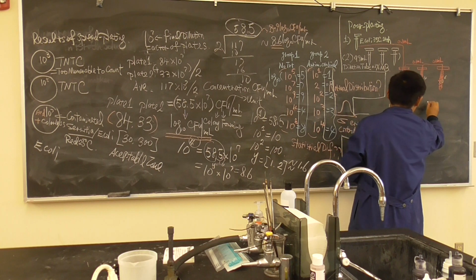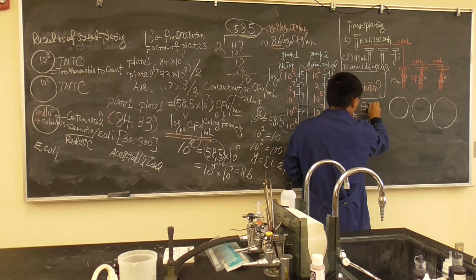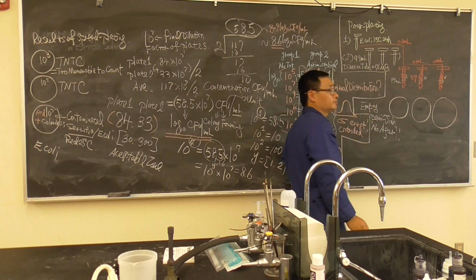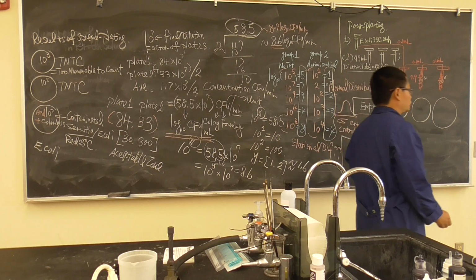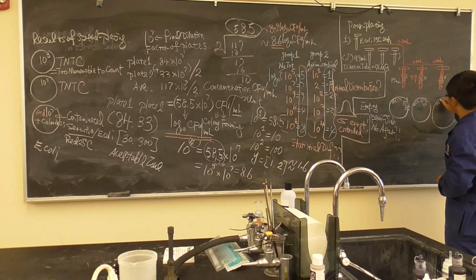You're going to get 3 empty petri dishes. This will be an empty petri dish. No agar there. This is the key, no agar. At the bottom of the plates, you're going to label your initial, batch number, bacterial name, and dilution factor.